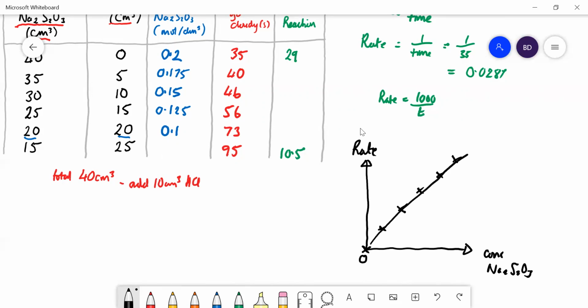Most important thing to realize, to understand there, is the things you're doing to make it a fair test, so that you're only changing the thio concentration and you're not changing anything else, like the concentration of the acid or the depth of the solution or anything.